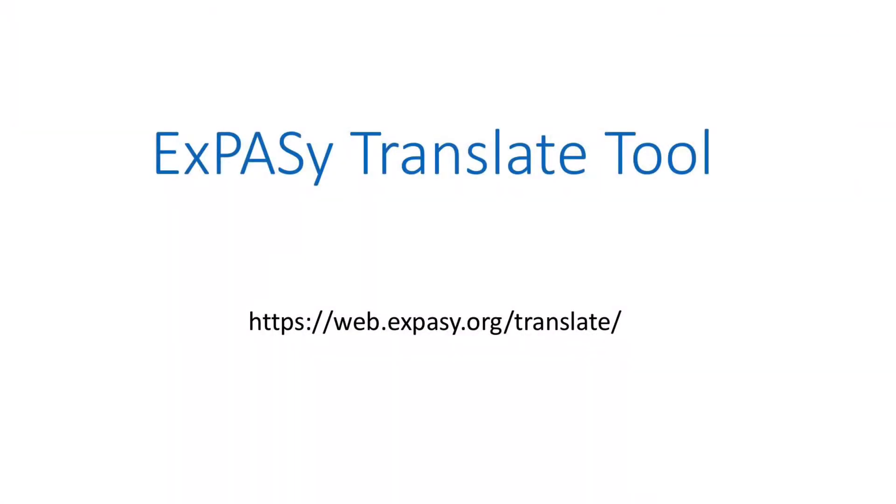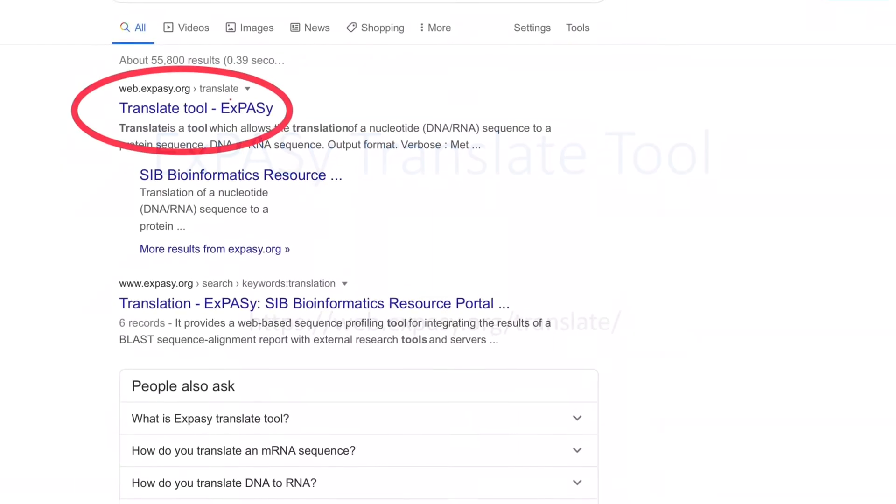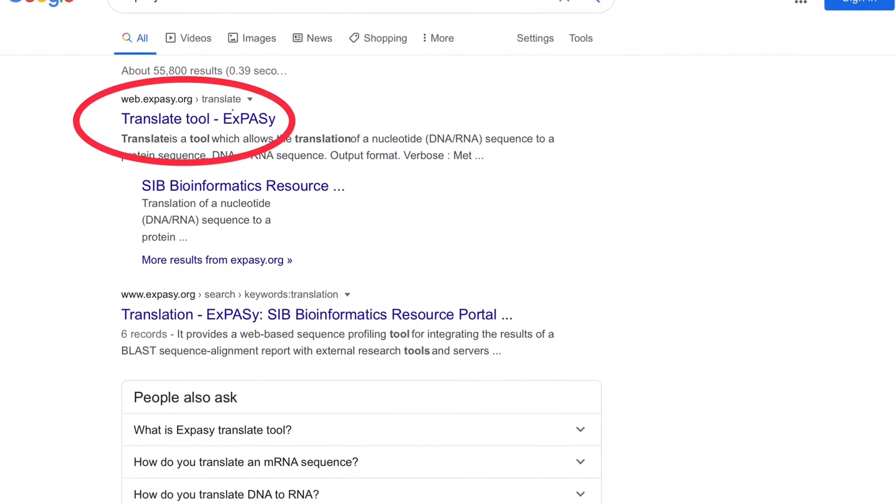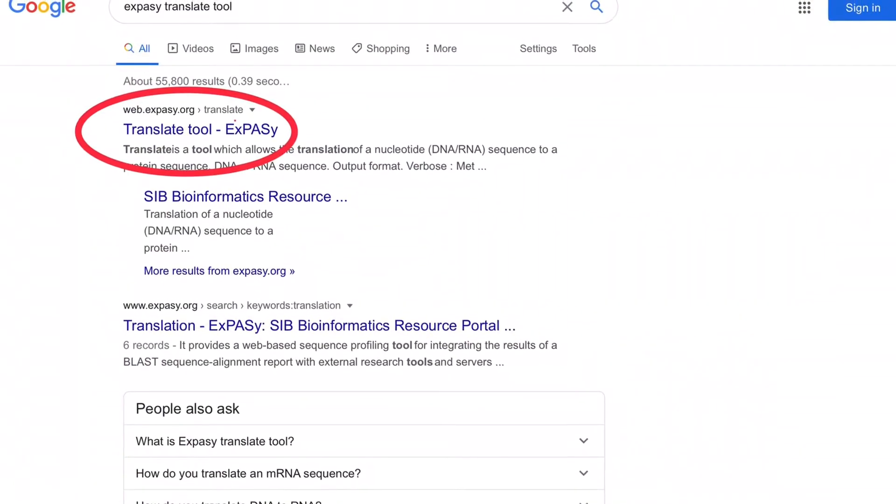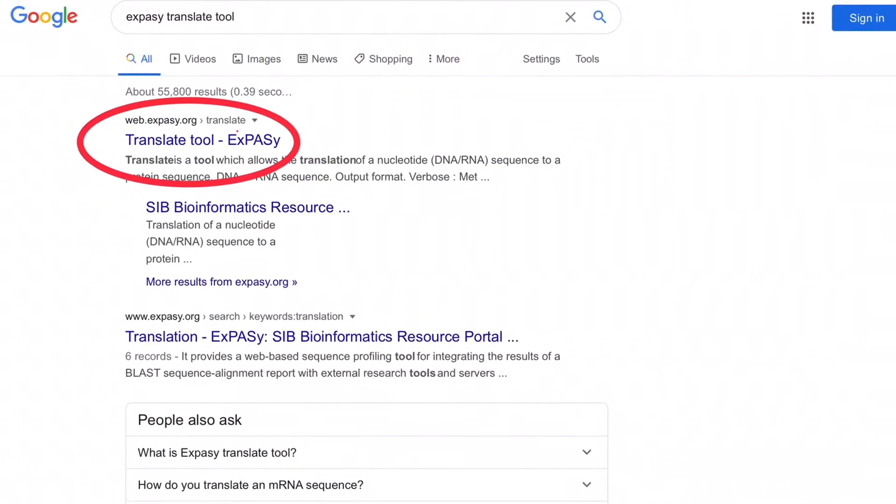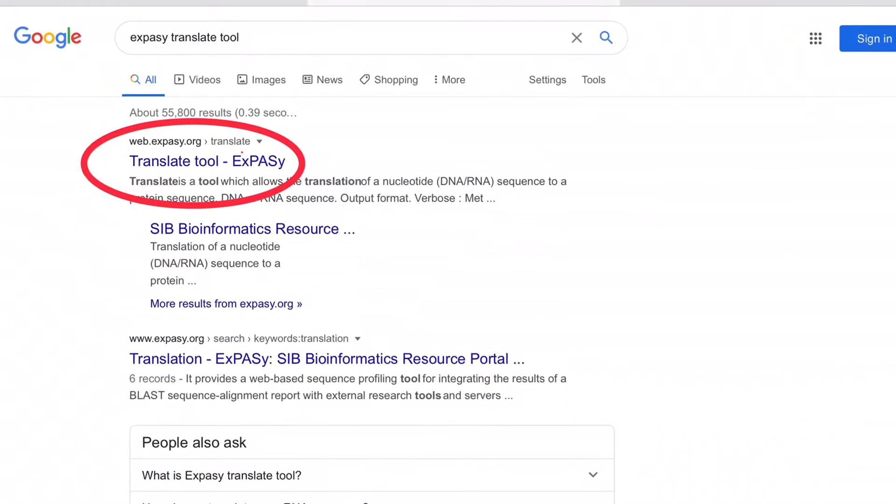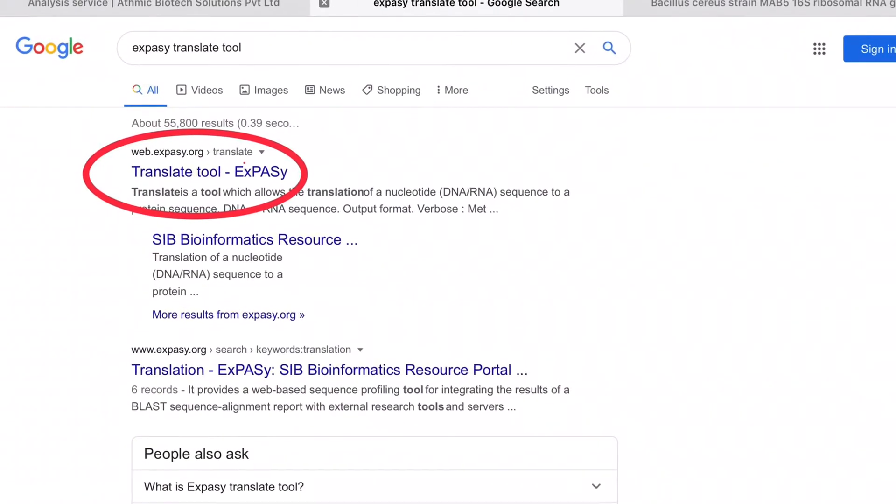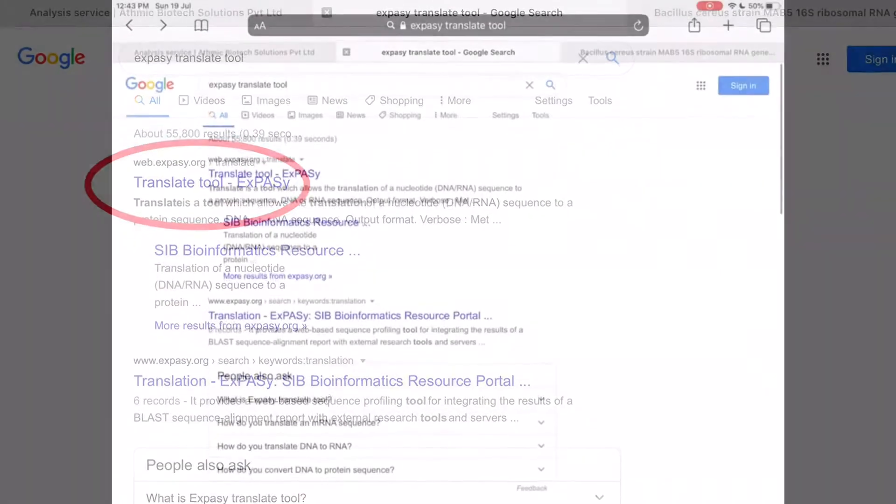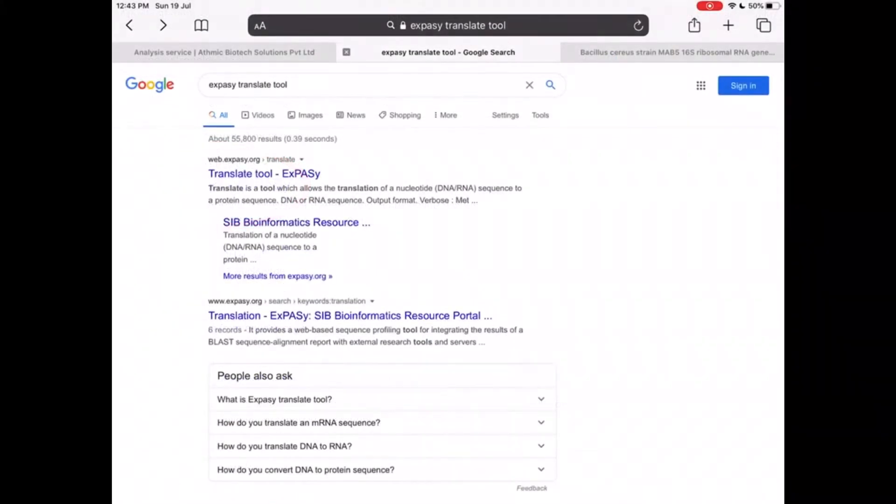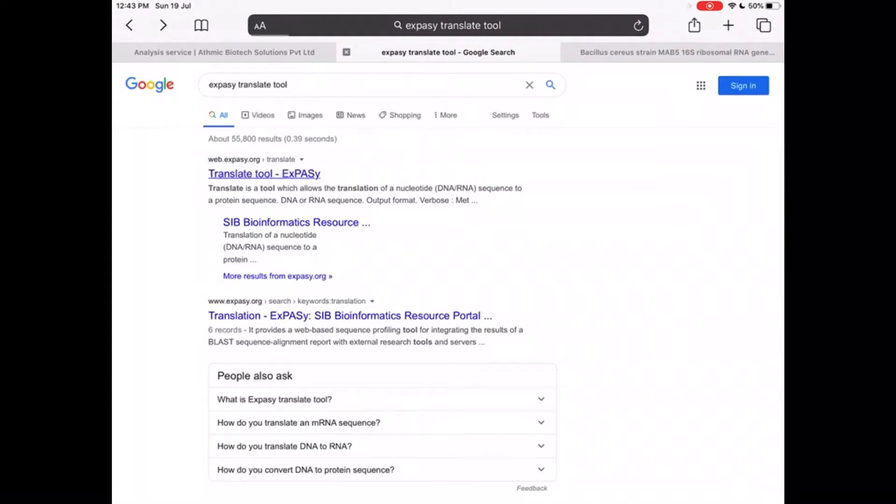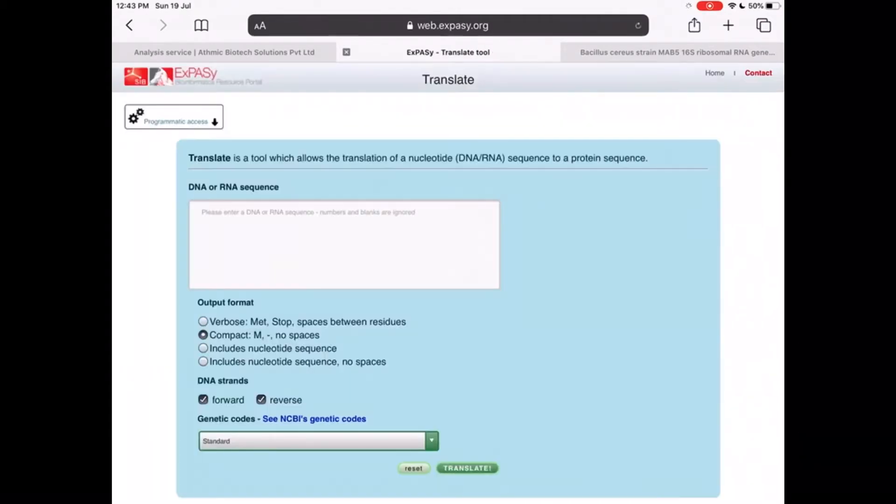Exparsi Translate Tool. Here you can translate both DNA or RNA sequence into its corresponding amino acid sequence. Just go to the Exparsi Translate Tool and the page will be like this.